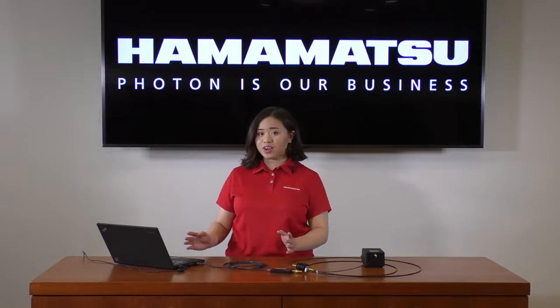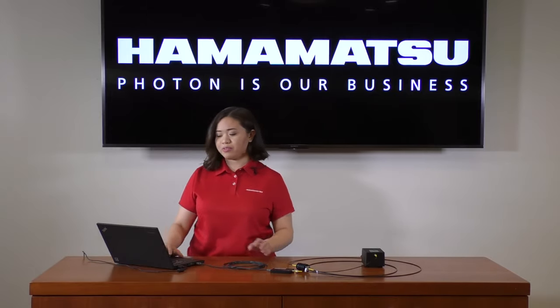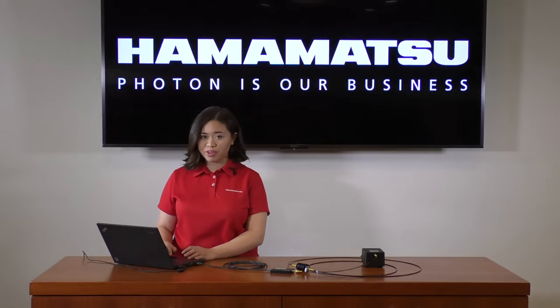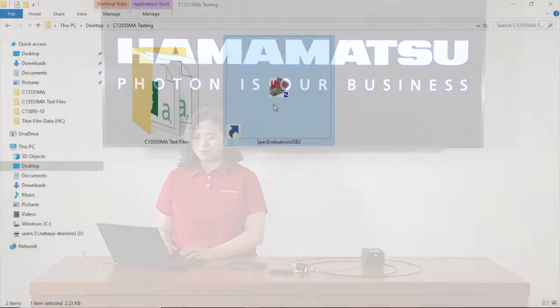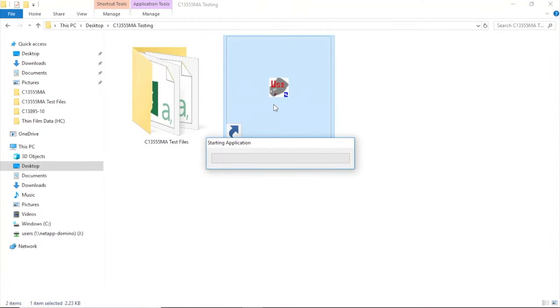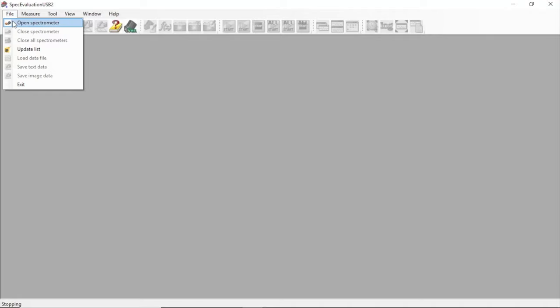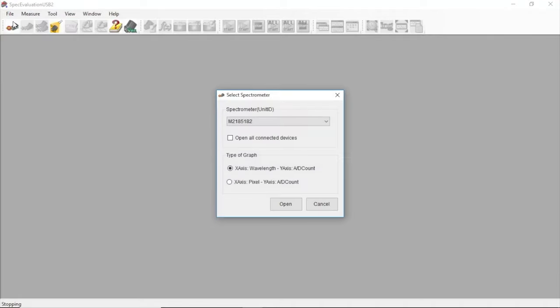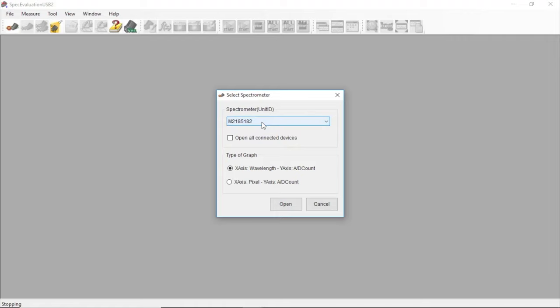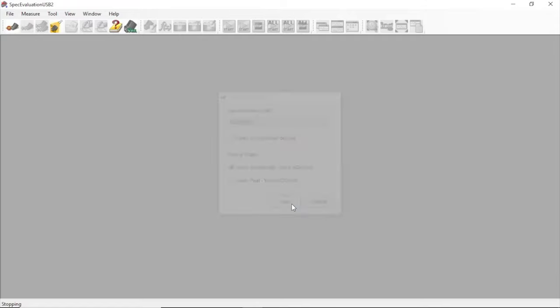So let's start by opening the appropriate software for the C13555 spectrometer. Contained within the software instruction manual that comes with this spectrometer are directions to install, operate, and uninstall this software. A useful table is also included in the manuals that goes over the functions behind each of the buttons in the software. So to open up the spectrometer, go to File and find Open Spectrometer. You'll select your spectrometer from the drop-down menu, noting that each spectrometer has its own unique unit identification number.